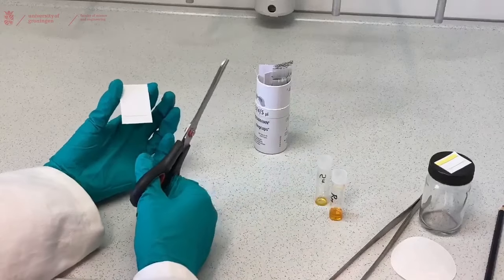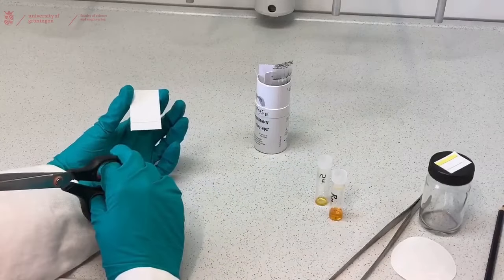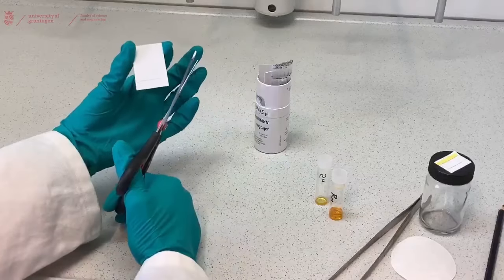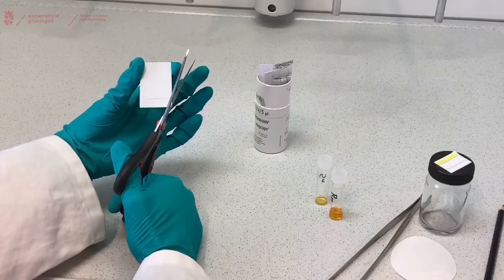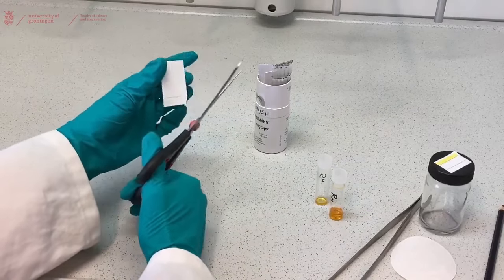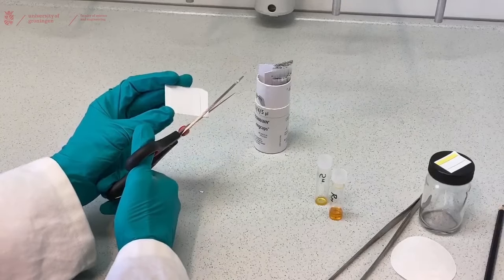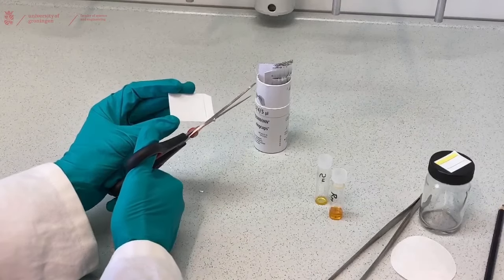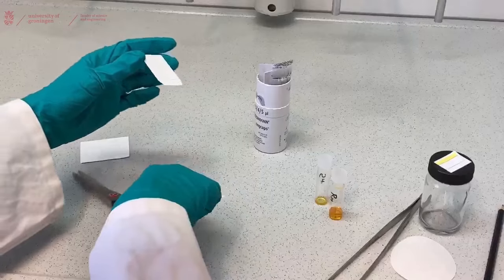Now there is one more thing we need to do before we start adding our spots and that is cutting off the corners, so a slight cut in the corners. That will make sure that our solvent front will be nice and smooth over the whole TLC plate.